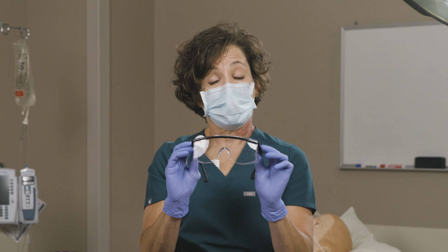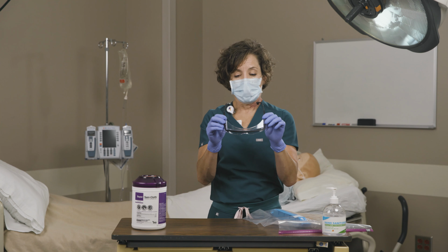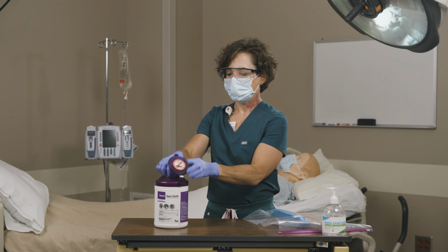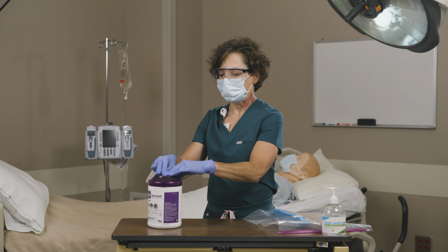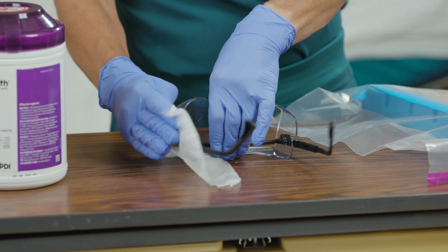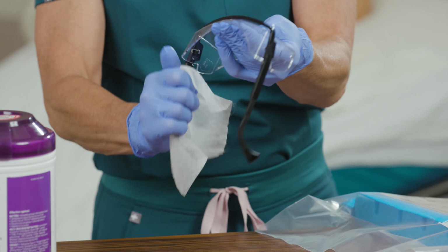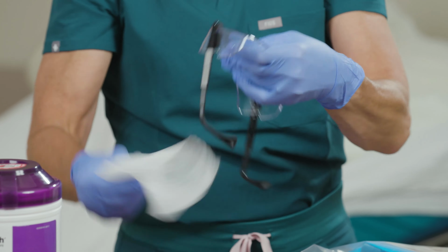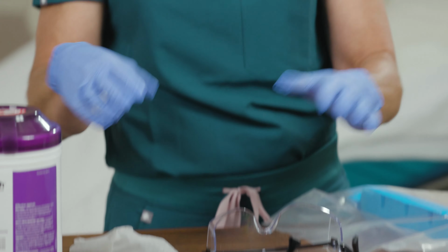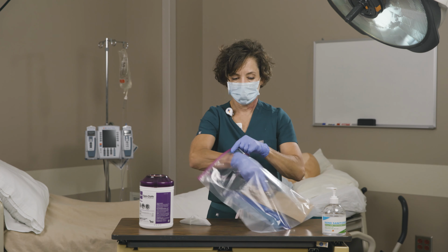We did not demonstrate goggles, so if there are caregivers that are wearing goggles instead of a face shield, we want to demonstrate the process in doffing them and disinfecting them. So you just set them off on a surface, get a disinfectant wipe, whatever disinfectant wipes are being provided for your facility, and make sure and just decontaminate all surfaces and allow them to have their contact time to dry. And then you can store those with the rest of your other PPE items that you're going to be reusing.